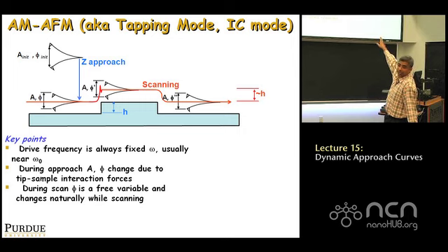We call that process of parachuting off. Okay, so it parachutes because it's tapping, and suddenly there's no sample underneath it. So the amplitude changes suddenly, and the controller needs to respond to that and bring down the cantilever, so the amplitude reduces again to the set point amplitude A. So A is referred to as the set point amplitude usually in this curve, okay?